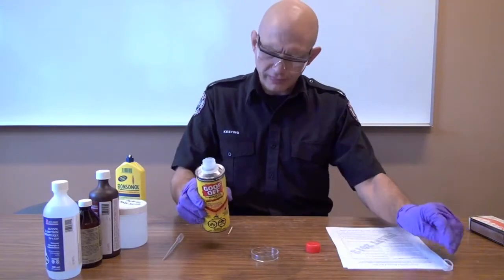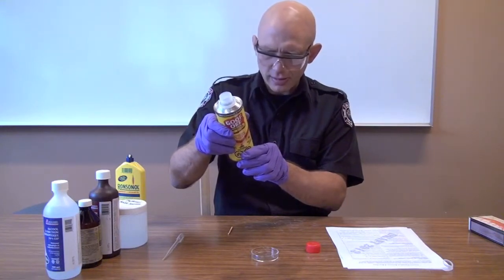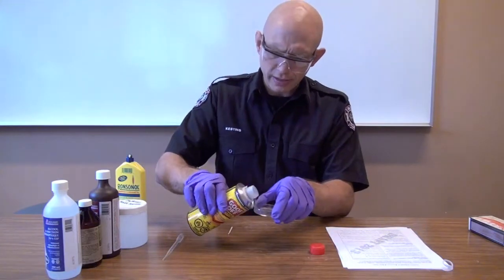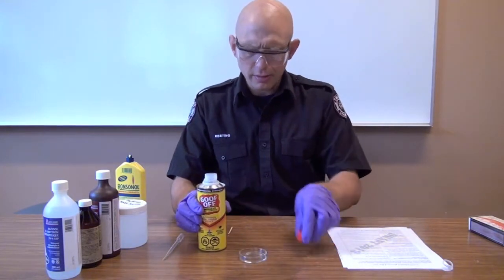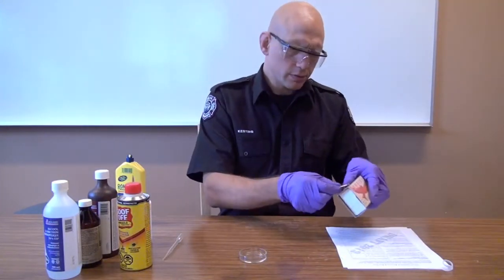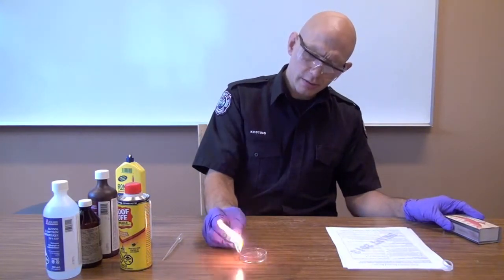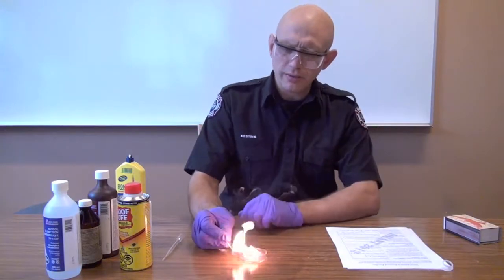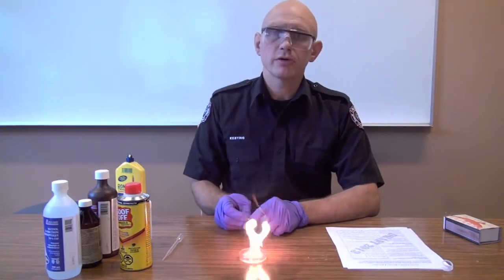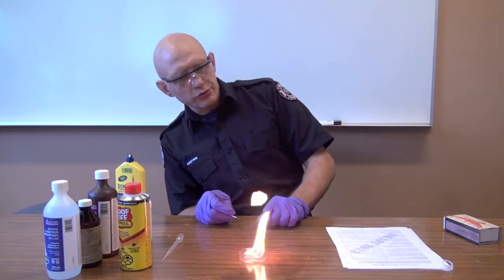Let's start burning some stuff. We're going to start with Goof Off, which contains alcohols, heptane, petroleum distillates, xylene, diethylglycol, monobutyl ether — lots of flammable stuff. Put a small amount in, strike a match, and bring it in from the side. The flame started long before we actually got to the material itself, burning with a yellow flame and not too much smoke.